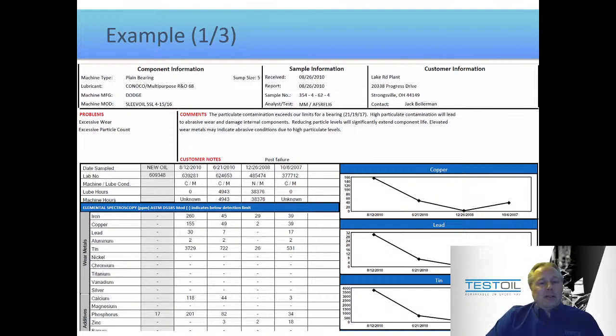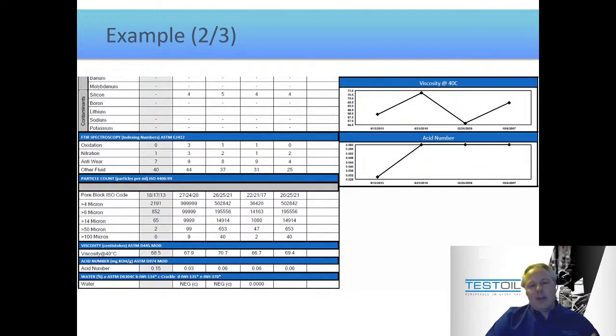If we keep going down the report, we'll see that phosphorus also looks very, very similar in that it is appearing when it shouldn't appear at those levels and it is increasing. And again, this will be another cause.